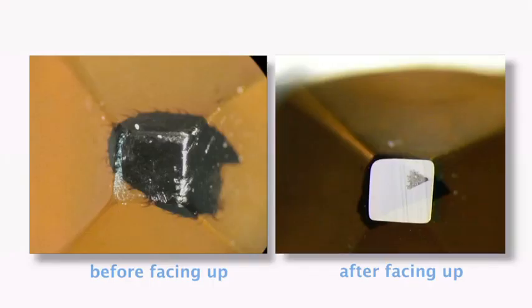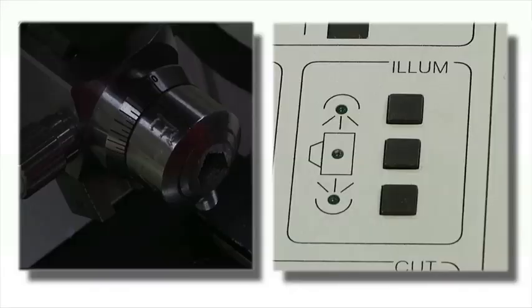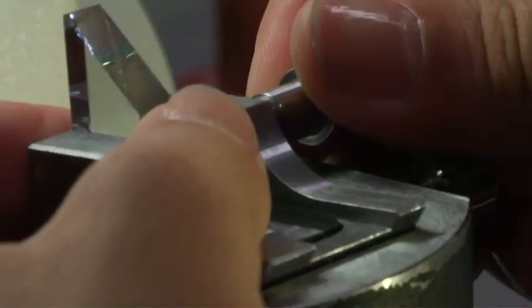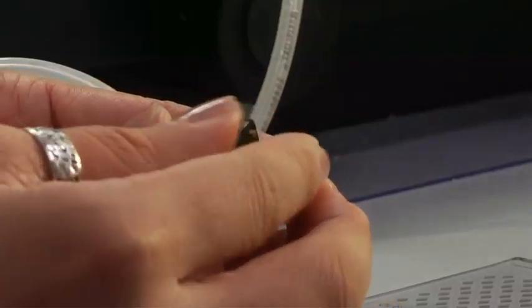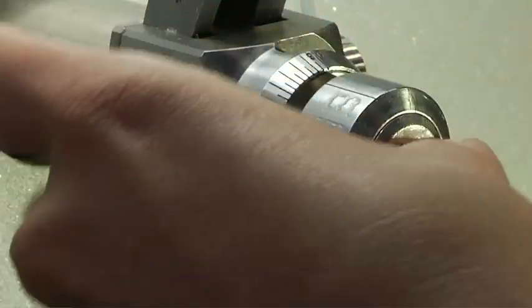Facing up is a process of removing excess resin in front of the sample to expose the sample to the knife. Start up the microtome, turn on both bottom and top lights, secure a dry knife onto the knife stage, tighten your sample block in the chuck, and then secure the chuck into the arm.